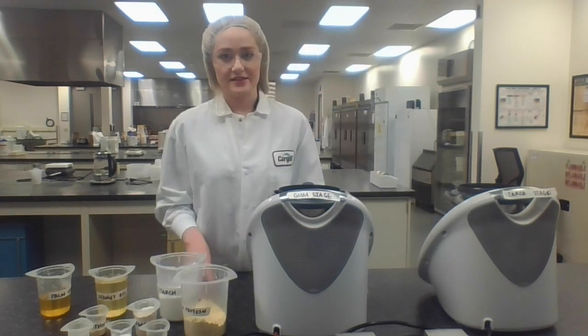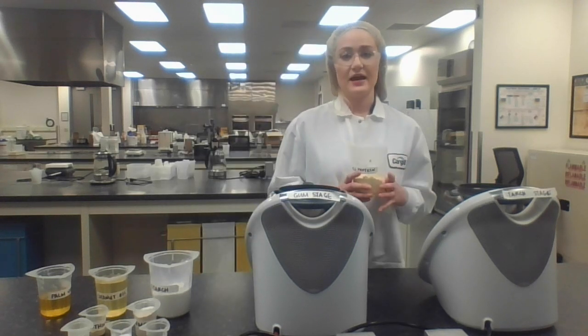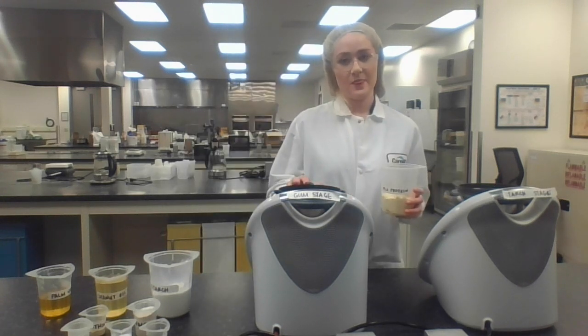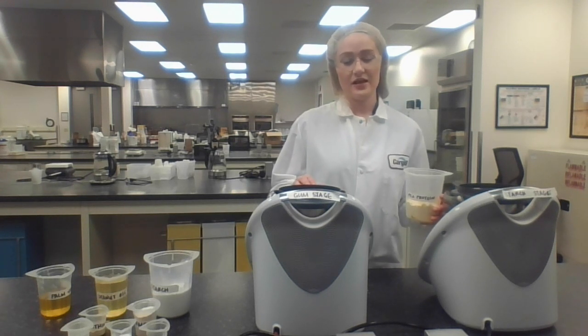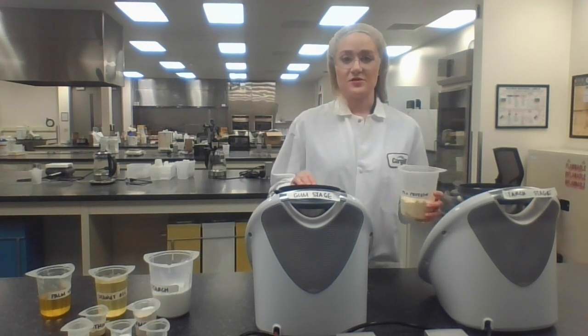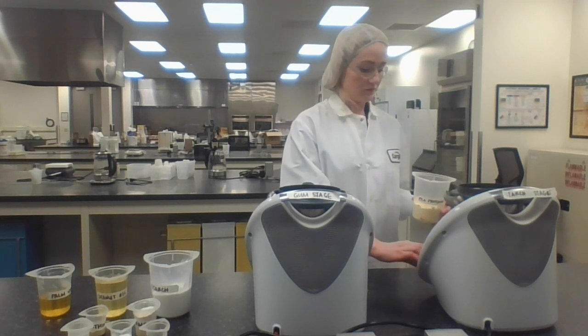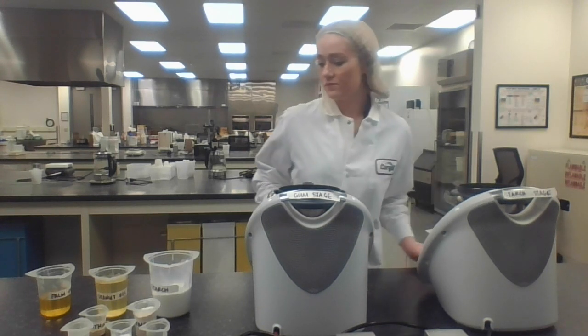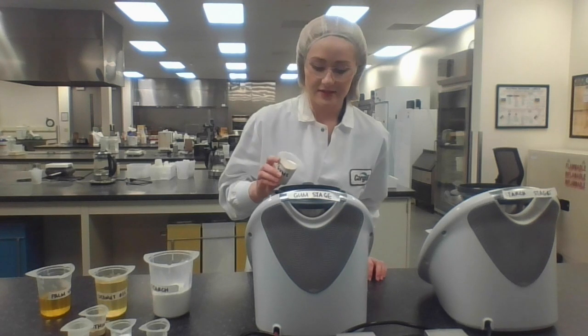Starting to create this today, we'll first be adding our protein to this left thermomix, and our gums and hydrocolloids to the right. The reason you split the two components at the beginning is that it is very important that all of your ingredients get fully hydrated. I have split water into both of these thermomixers so all of the ingredients have an opportunity to hydrate. You'll go ahead and add your hydrocolloids into this one.